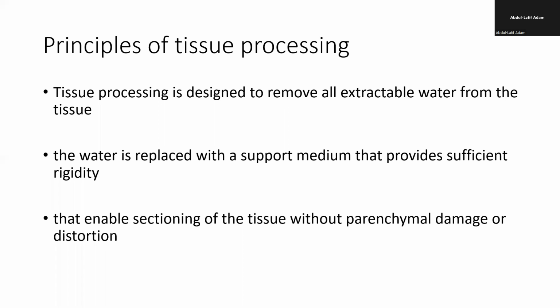When you remove water from the tissue, it has to be put in a medium that is solid enough to support it. After removing all the water, the water is replaced with a supporting medium. Usually in histology, we use paraffin wax.